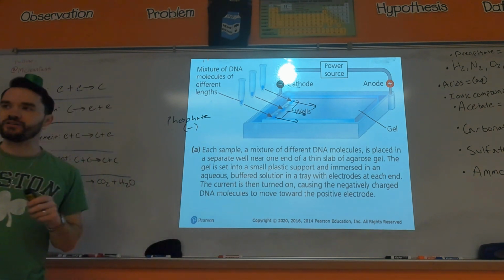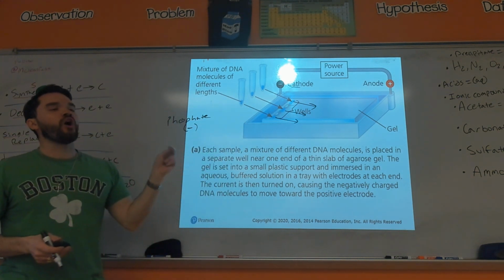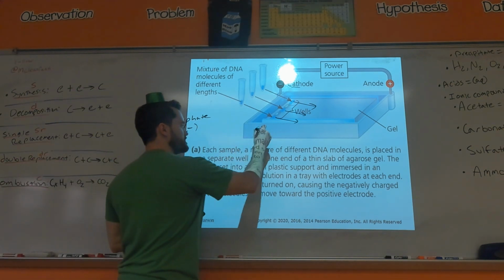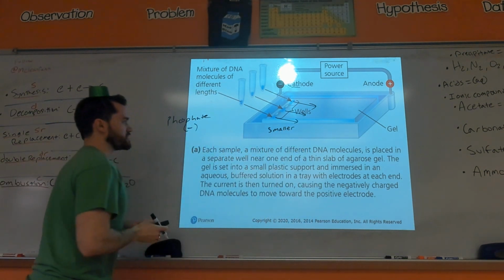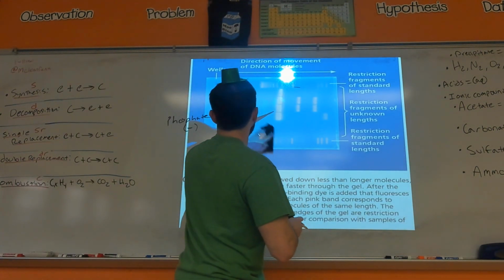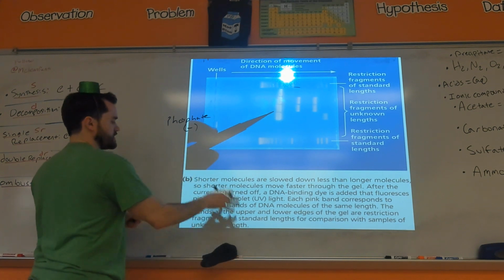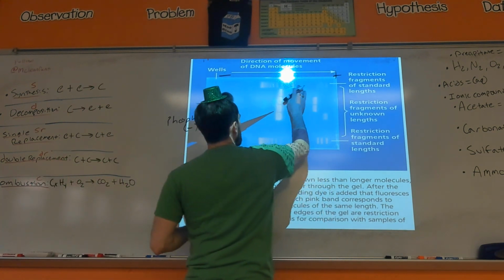And so as that DNA is moving, smaller fragments of DNA, let me explain, actually. This is the negative end, this is the positive end.